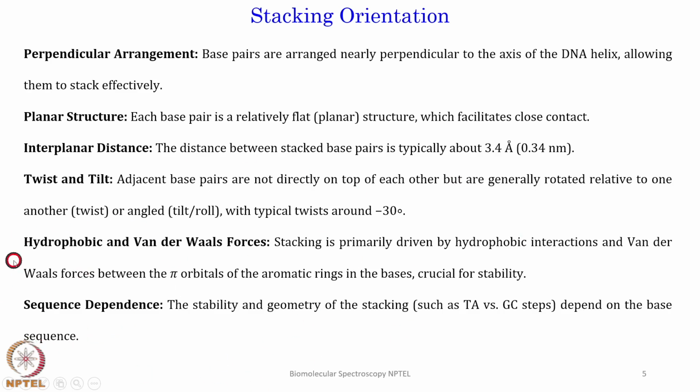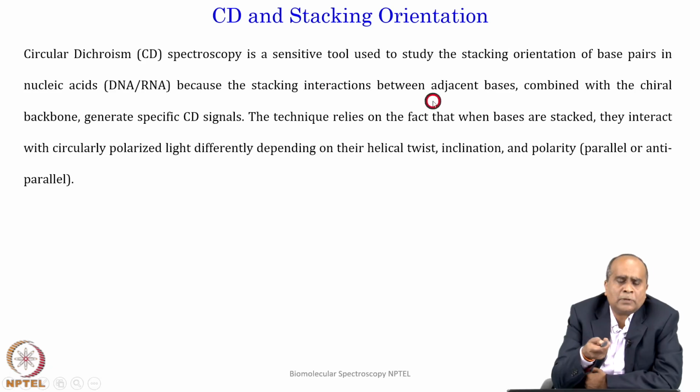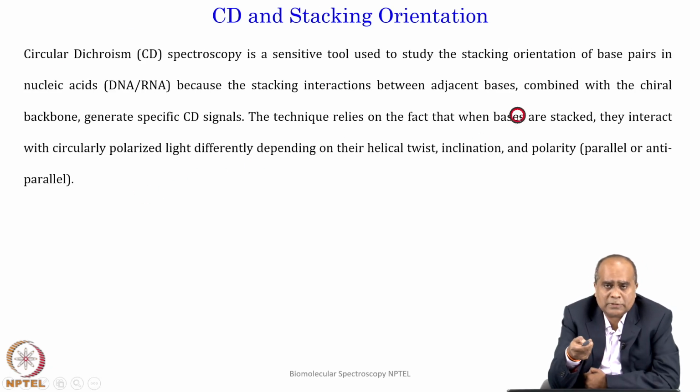And then there is a sequence dependence: the stability and geometry of stacking, such as AT versus GC, depends upon the base sequence, where and how they are adjusted. So, now, how can CD be used in this base stacking orientation?